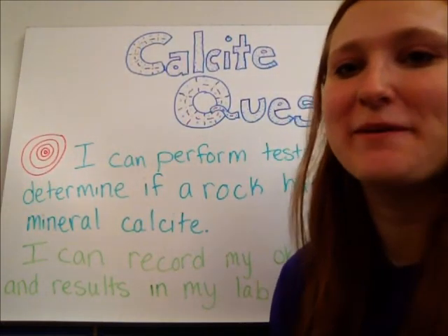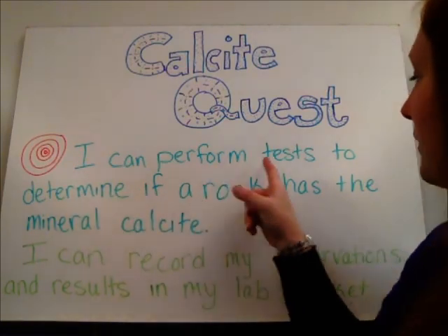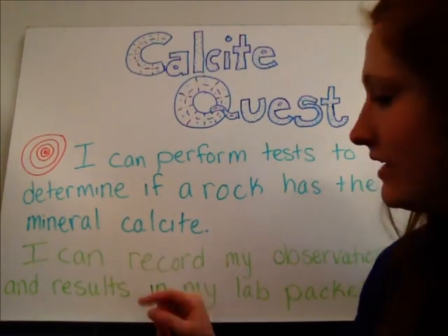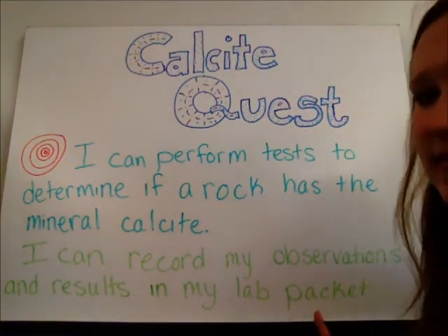Hi friends, we're going to talk about the Calcite Quest. Our learning targets are, I can perform tests to determine if a rock has the mineral calcite. I can record my observations and results in my lab packet.